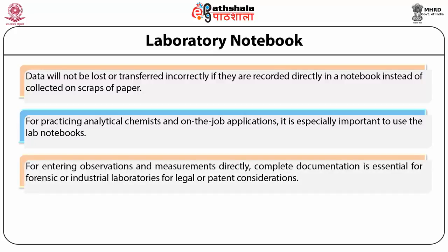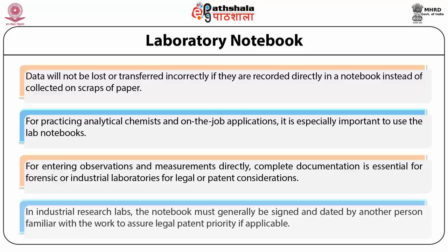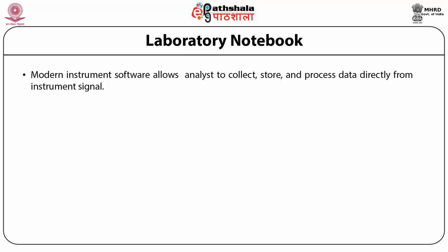Data will not be lost or transferred incorrectly if recorded directly in a notebook instead of on scraps of paper. For practicing analytical chemists, it is especially important to use the lab notebook for entering observations and measurements directly. Complete documentation is essential for forensic or industrial laboratories for legal or patent considerations. In industrial research labs, the notebook must generally be signed and dated by another person familiar with the work to assure legal patent priority. Modern instrument software allows analysts to collect, store, and process data directly from the instrument signal based on appropriate calibration, and it is important that software and calibration can be validated as part of good laboratory practice.